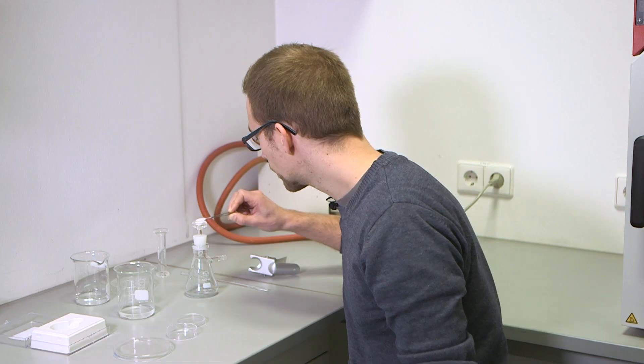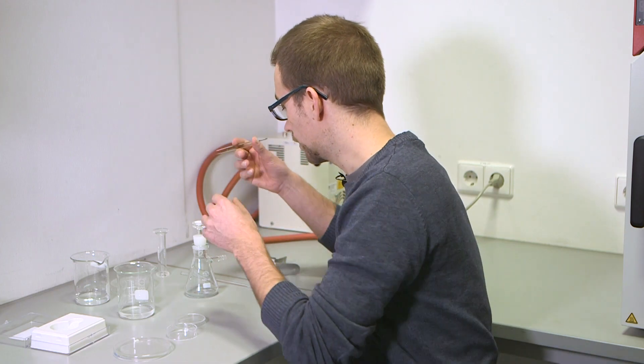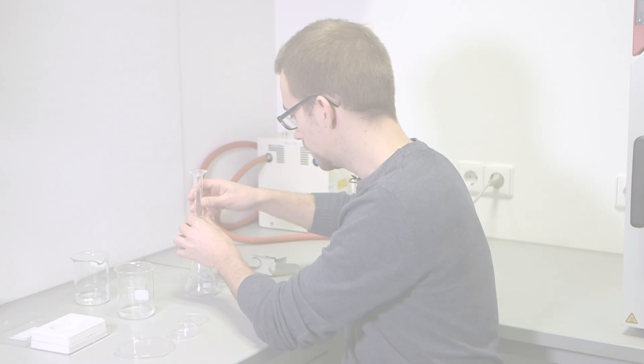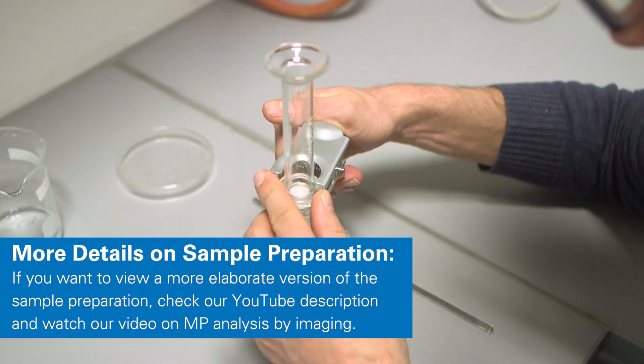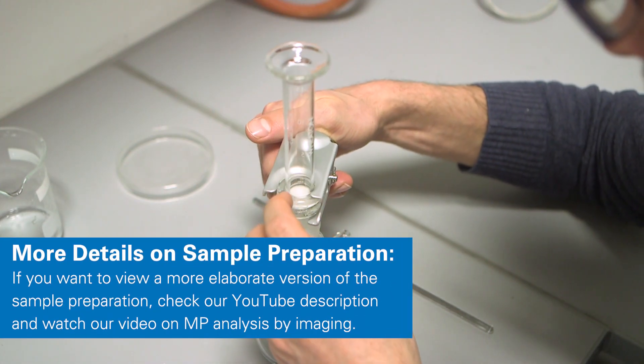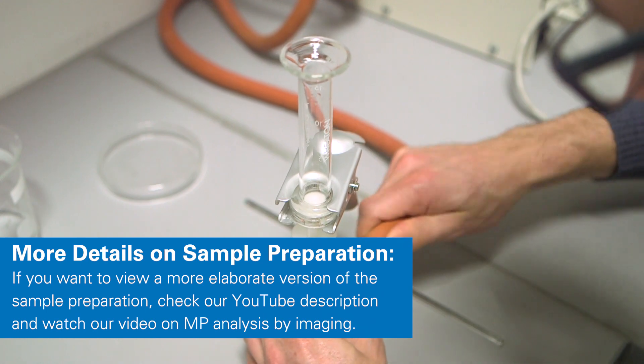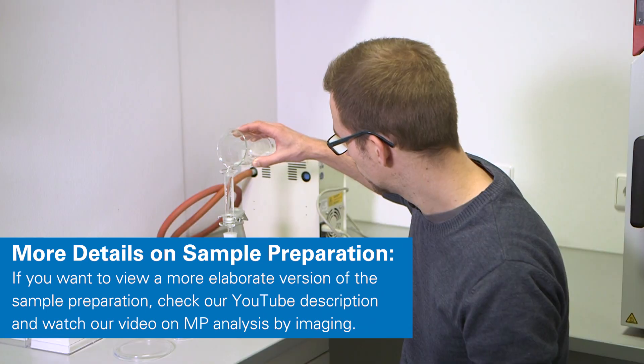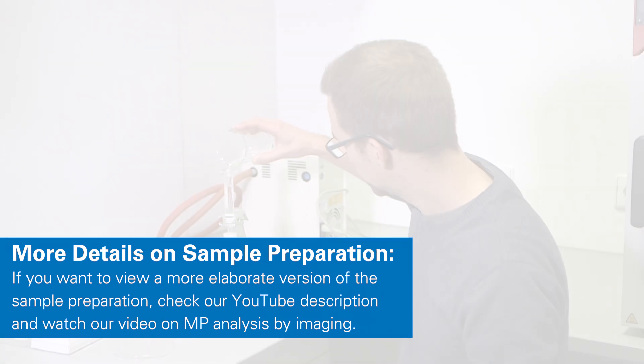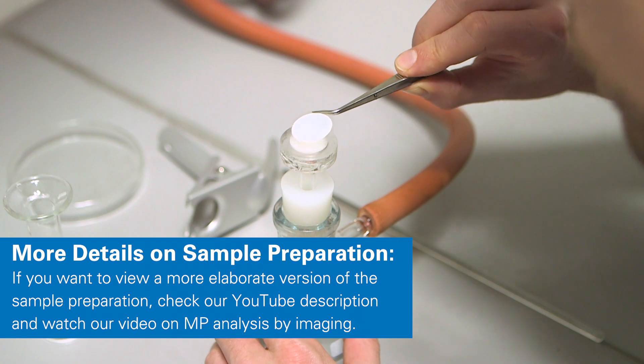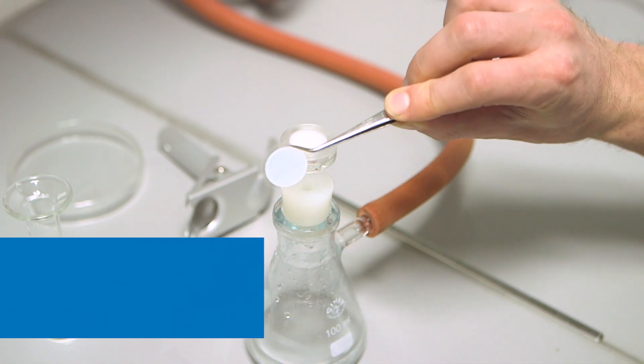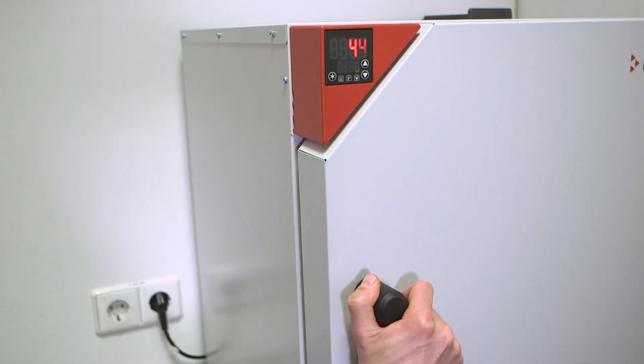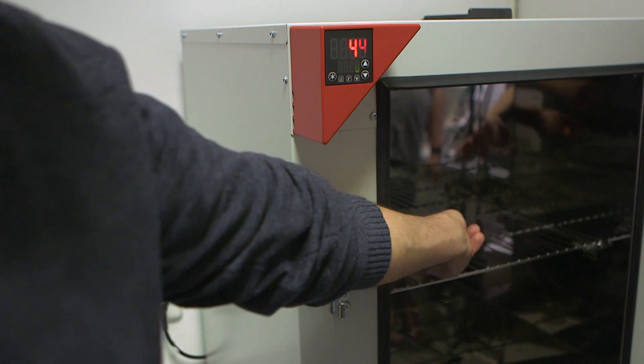The filter was placed in a specialized setup and a vacuum pump was used to speed up the filtration process. When the filtration was done, the filter was placed in an oven at moderate temperatures.